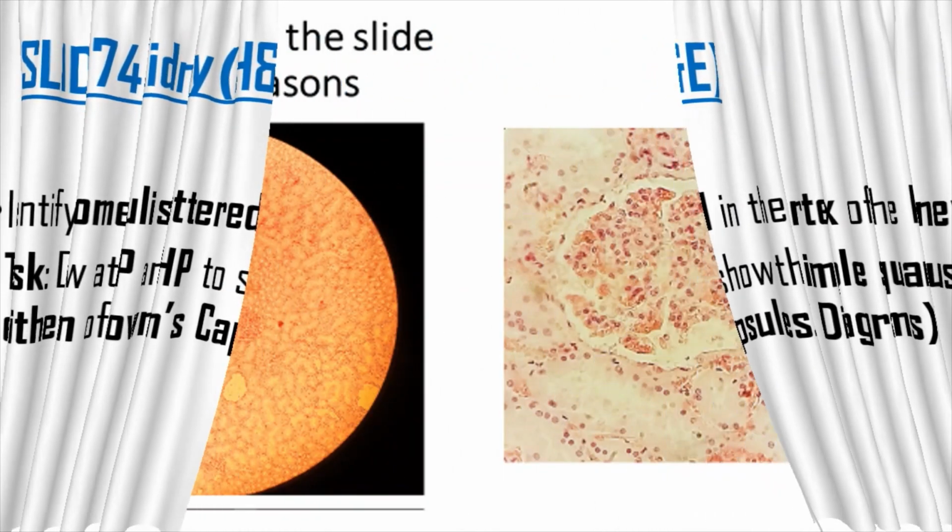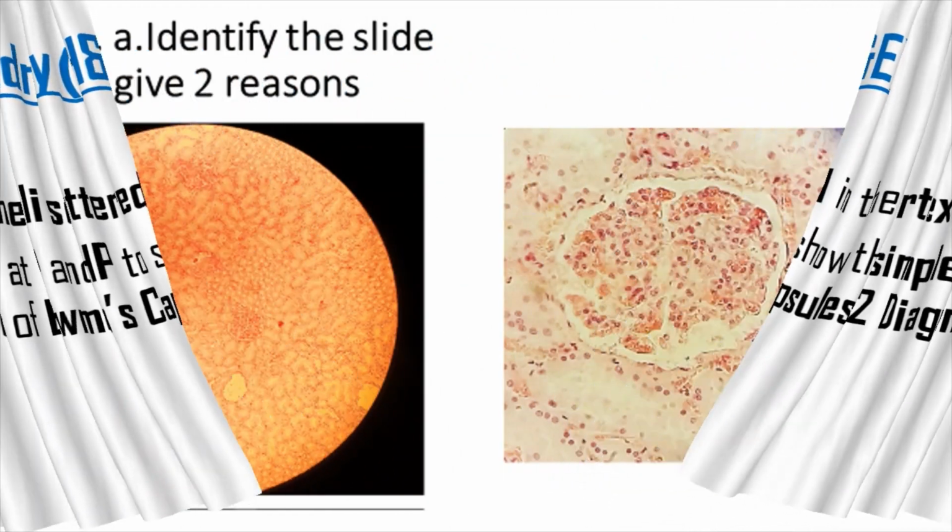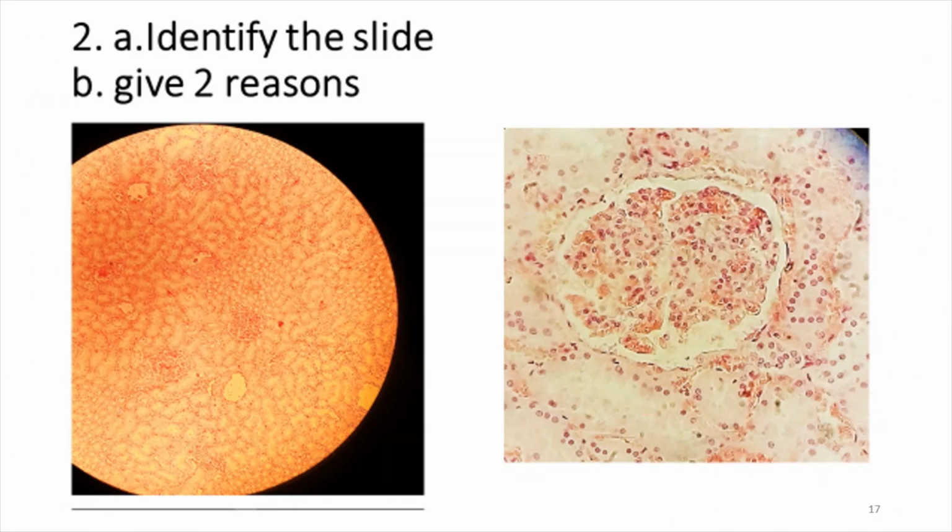So now, the one that is on the left here, this is low power. And now you may ask, where is the Bowman's capsule? This is the Bowman's capsule here. Okay, so that's what you should focus on drawing. So just show the Bowman's capsule at low power.